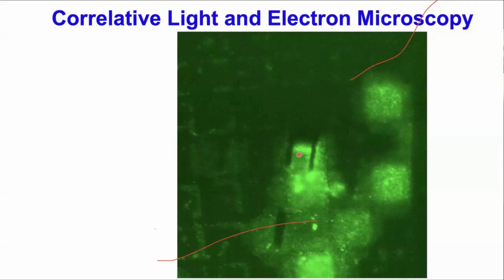This is very helpful to do cryo correlative light and electron microscopy directly from one piece of equipment. It's not like we are taking different images of EM and light microscopy separately and merging them. Here, the same equipment and same sample together, simultaneously, you can generate cryo light and electron microscopy, which very few labs in India are doing for this kind of experiment.